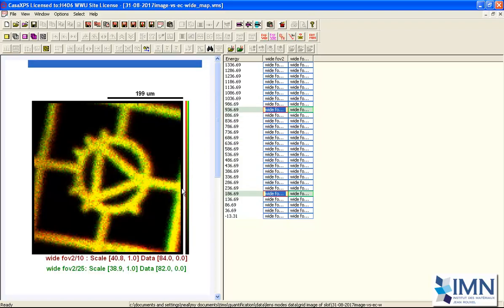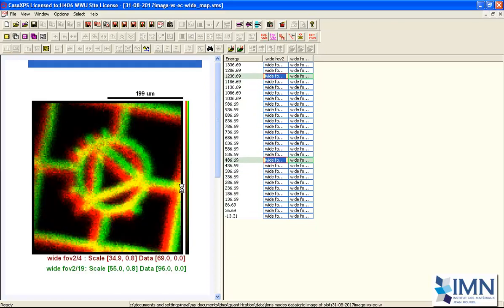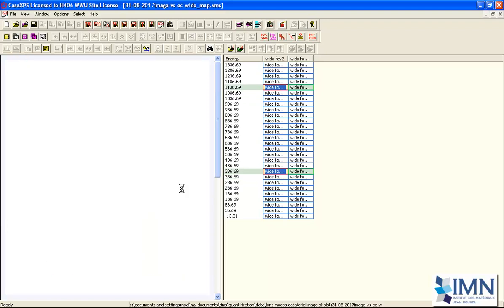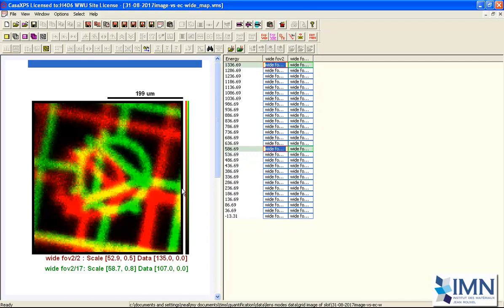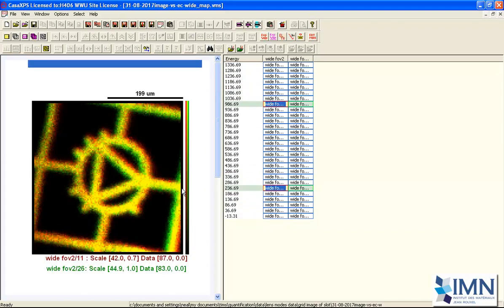So actually, if I go up, you can see that for the most part the images align very nicely over an interval that would be equivalent to that Fluorine 1s and 2s. At low kinetic energy the images start to move. But apart from at low kinetic energy, we have very stable and well-formed images, and these images are being passed into the analyzer when we do spectroscopy.